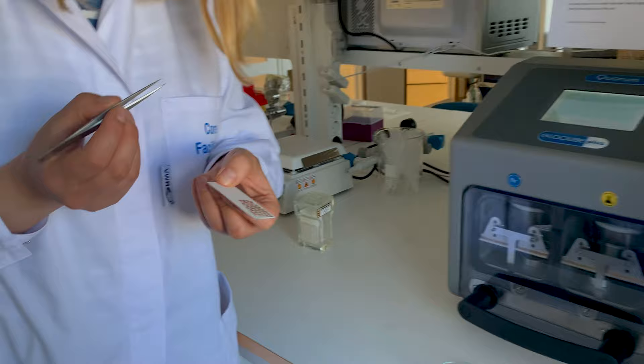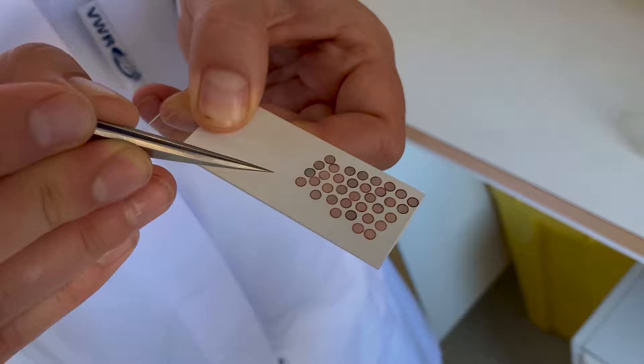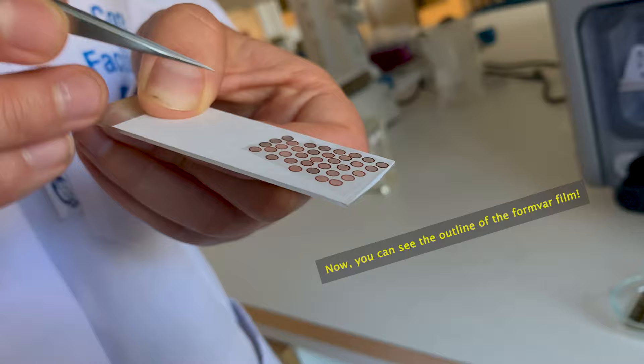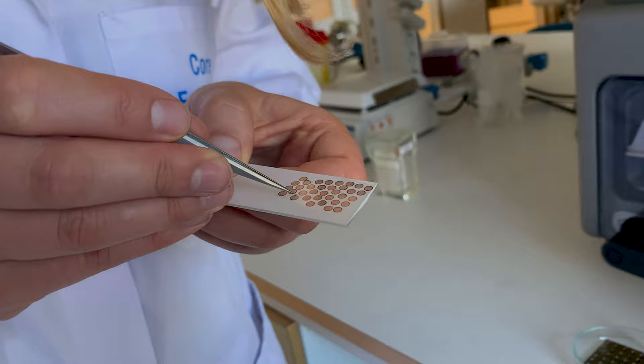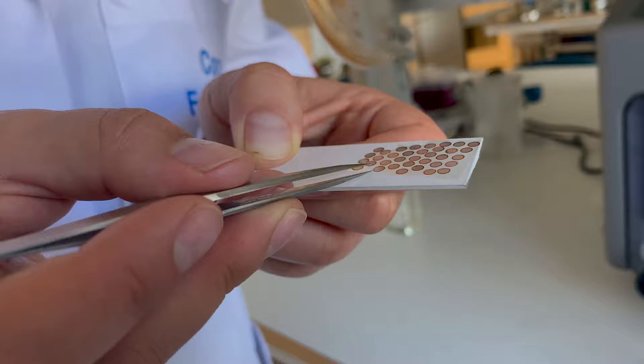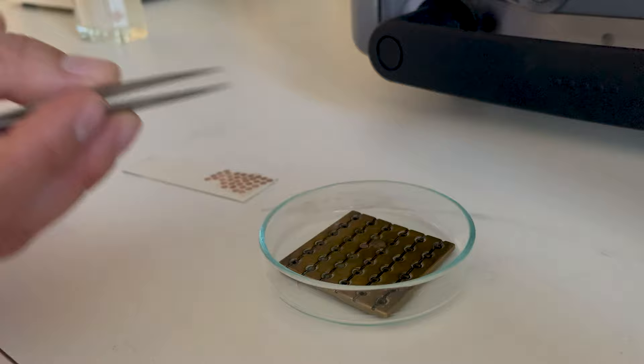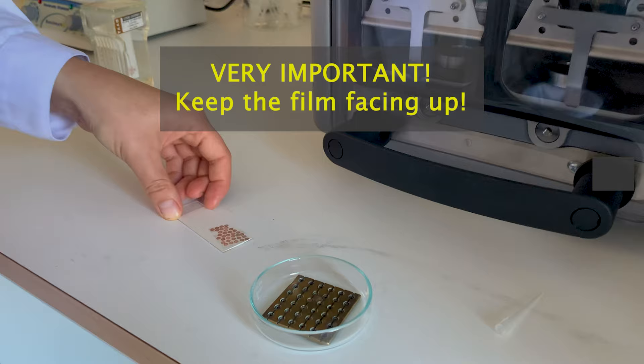While I'm waiting for the interface to load I can pick up one grid. You can see the outline of the formvar film, which is this shiny rectangle here — it's an extremely thin foil of plastic-like polymer that coats the mesh on the grids. I'm first going to score around the grid to interrupt the film so that I don't drag more than one grid with me, then I just lift it and place it on a support plate here.